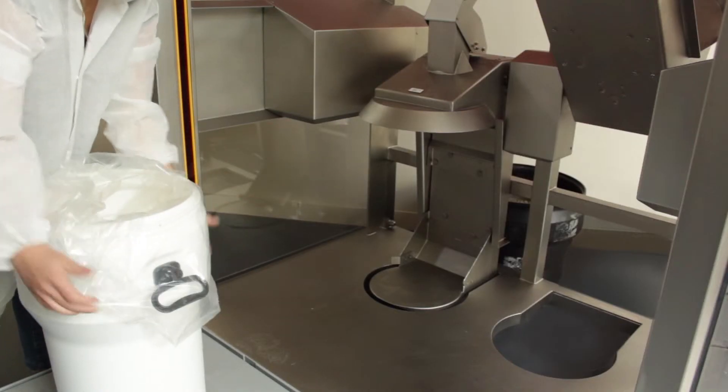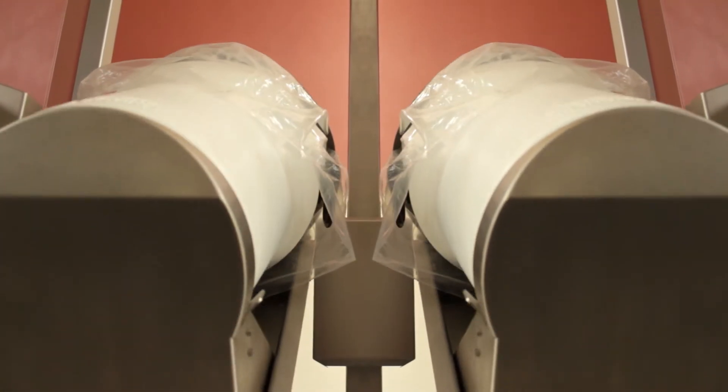While one drum is tipping, the operator can open a second drum and place it in the other unit.